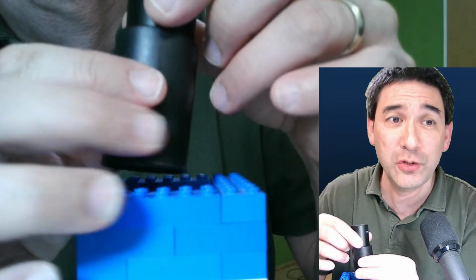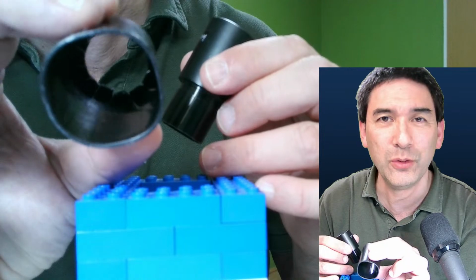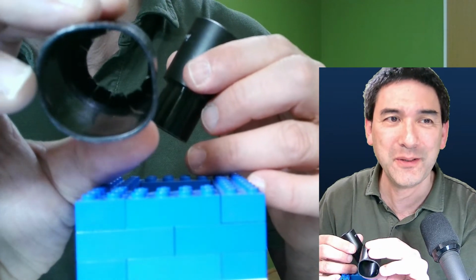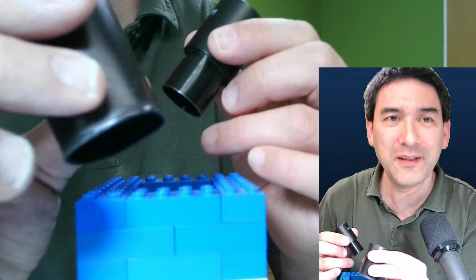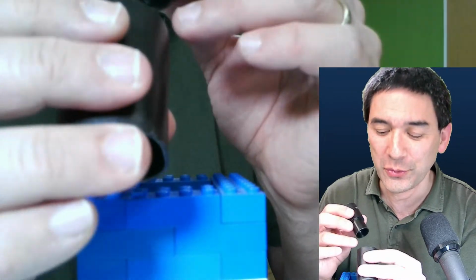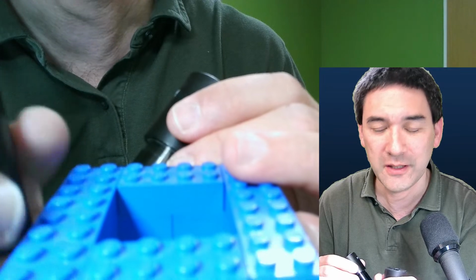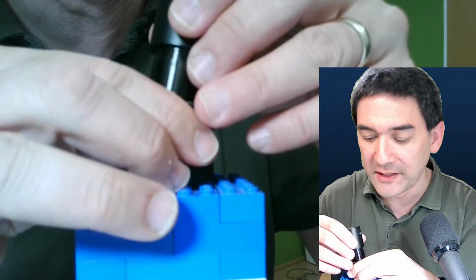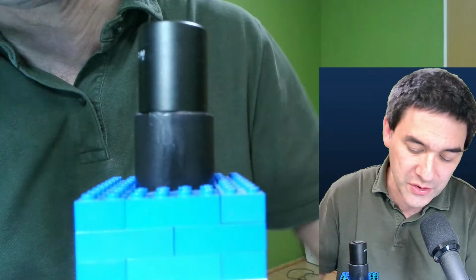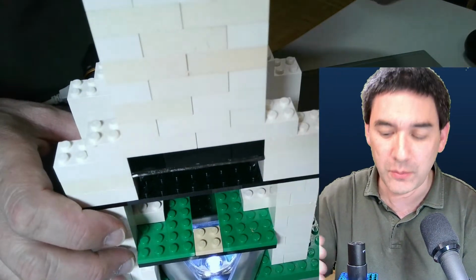Now, this plastic tube, some of you might actually know what it is. It's an old film canister. These things can still be bought on eBay, but I think a cardboard tube would also do, and I was just able to fit it in here. If you look over here, it's just square, and if you have the correct distance, then of course it'll work.